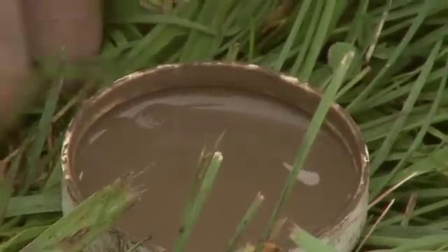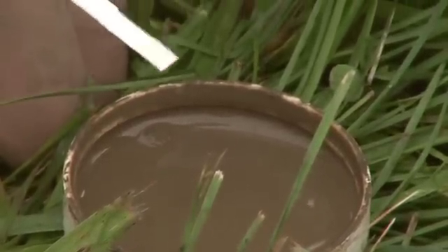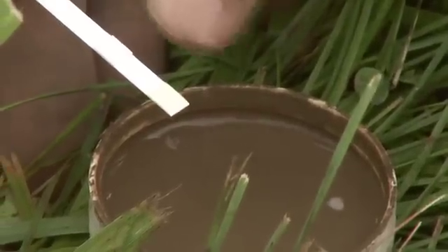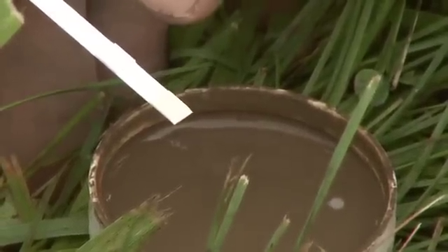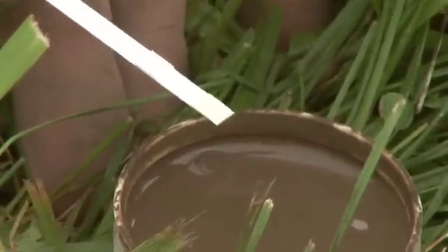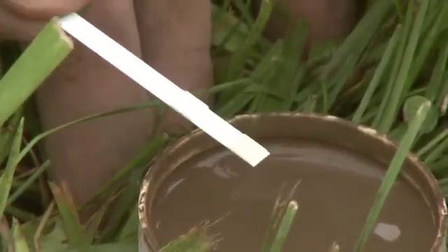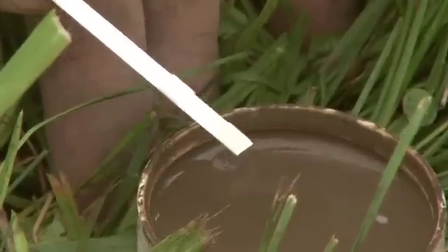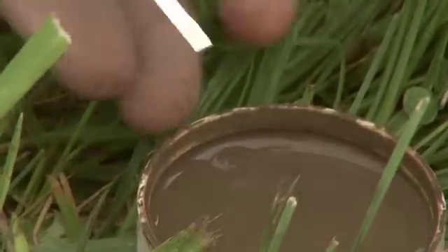All of the tests — nitrate, phosphate, pH — are done in the same manner. The bottom pad is for nitrate. The second one up is for nitrite. Nitrite is an earlier form in the nitrogen cycle, and typically you have to have very, very high nitrate levels for nitrite to show up.